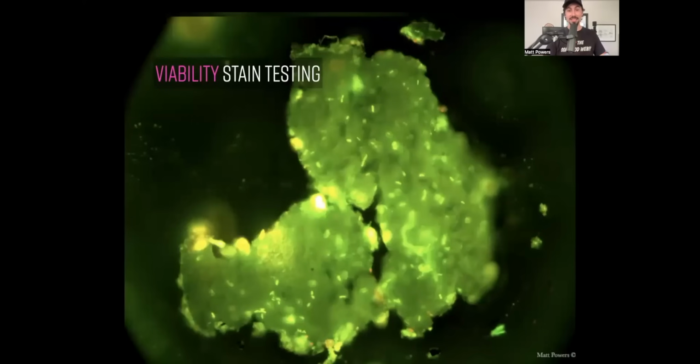All right. And this viability testing, when you do it on organic matter, can you guys see the actual bacteria? How clearly defined is it? Can you see the streptococci?